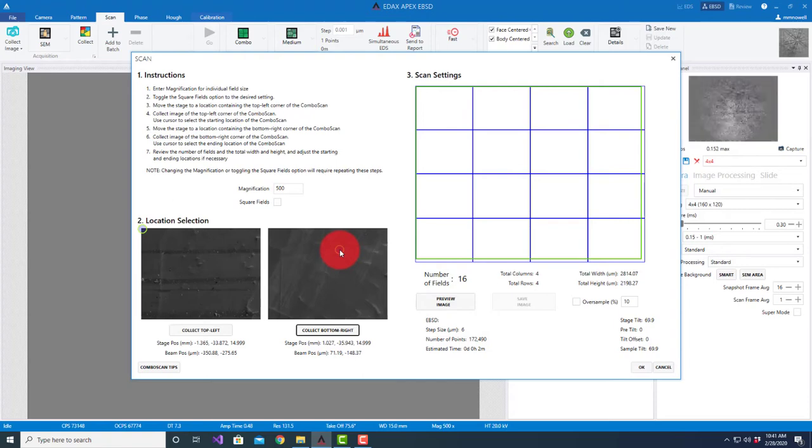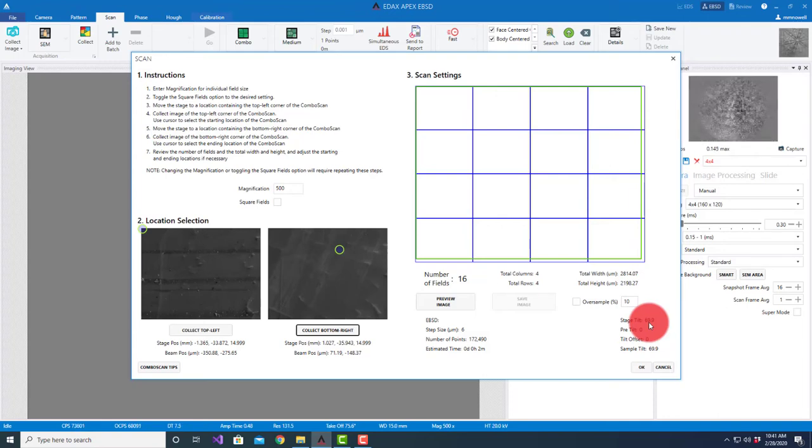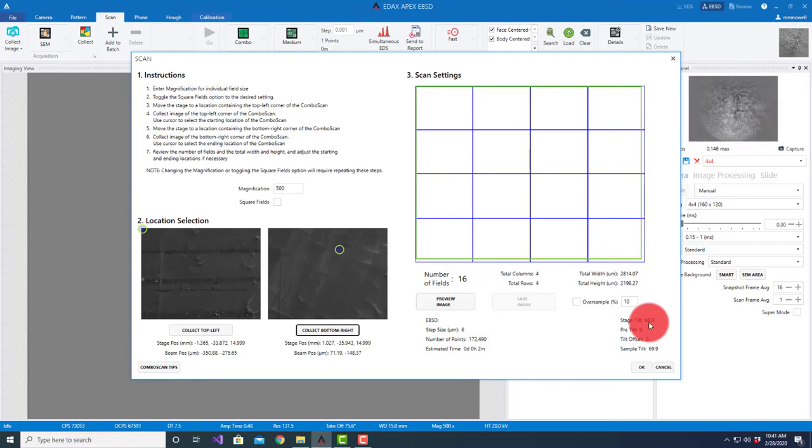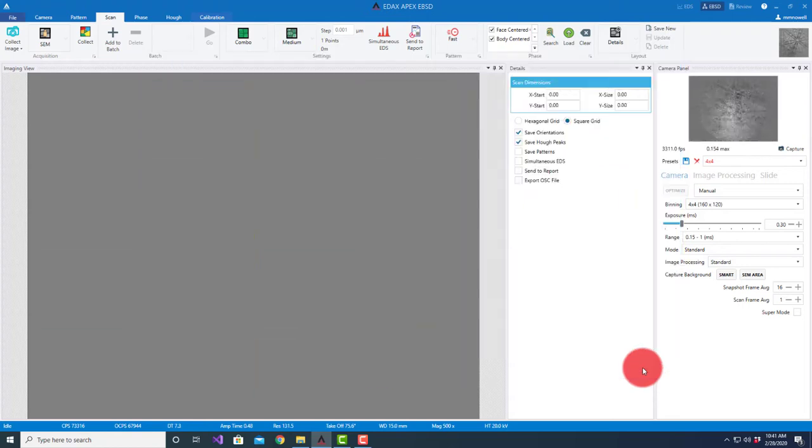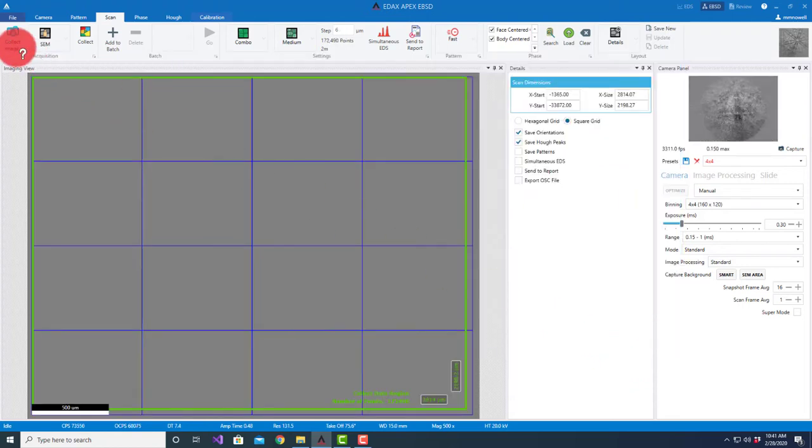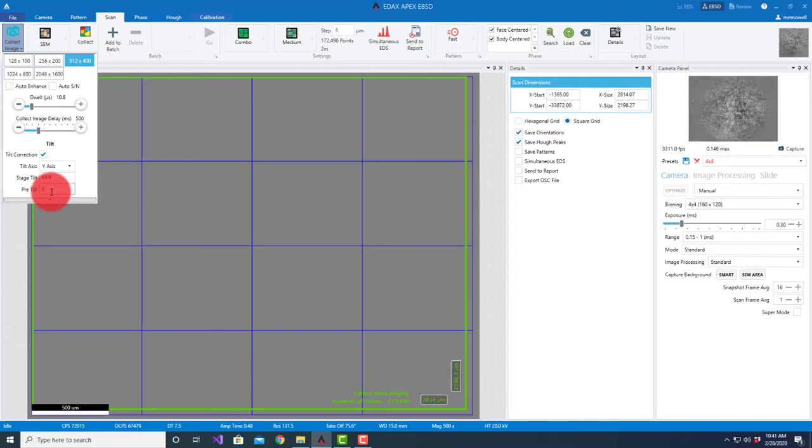Now we talk about the sample. Right now I'm using a stage tilt - I've typed in 70 but the microscope is reading 69.9. There's no pre-tilt, there's no tilt offset. Pre-tilt is of course if you're using a pre-tilted holder. I'm going to hit okay to this. If we come under here to collect image, this is where we can set up the pre-tilted value.